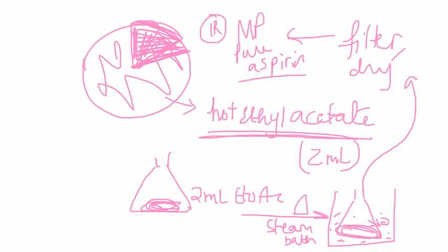You'll discuss the 50% yield, and you'll discuss the melting point of aspirin, and that is what you're going to report in your report. So just to make a little schematic perhaps so everybody is on board.